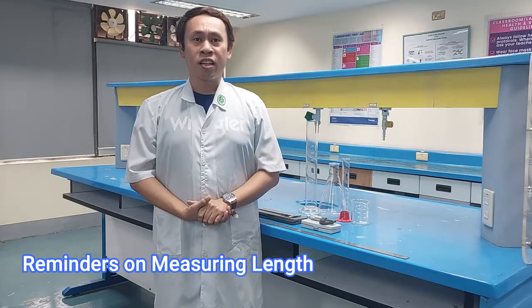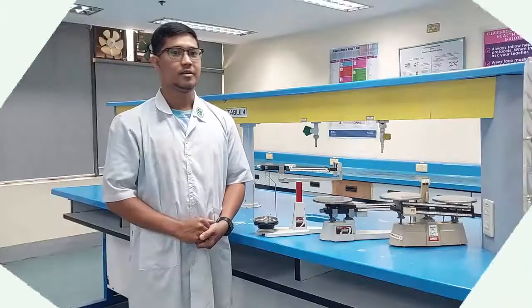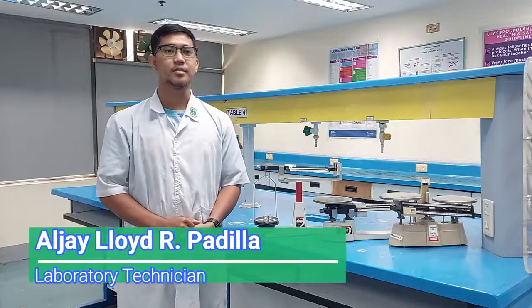Reminders on measuring length. It is important to convert different units of length into one before solving the questions. Meter is also called the SI unit of length or base unit of length. For the second measurement technique, let's proceed with the measurement of mass.